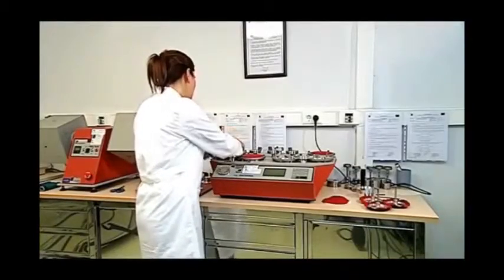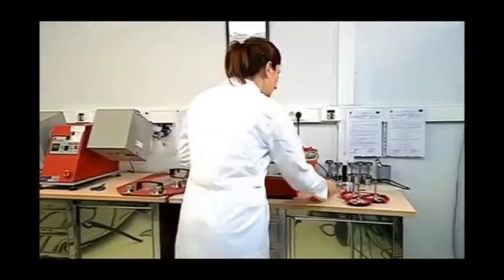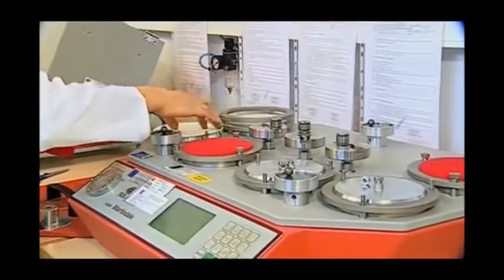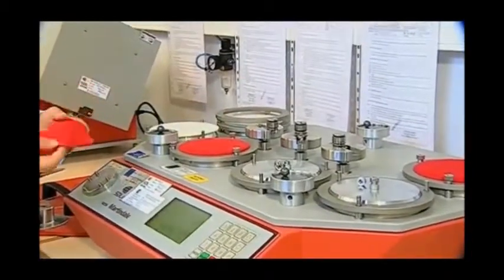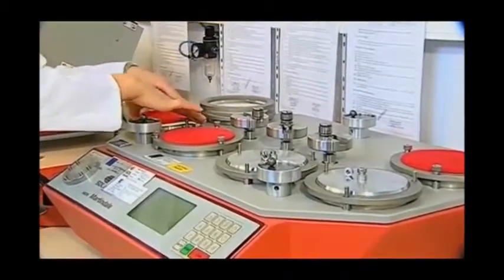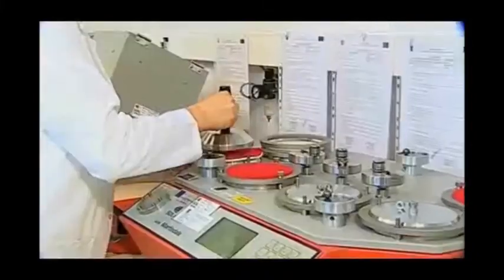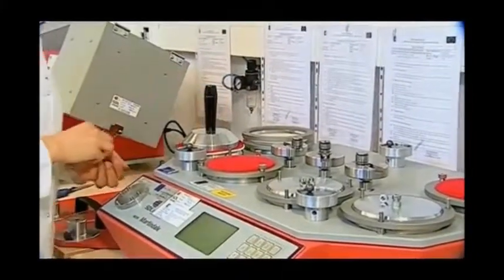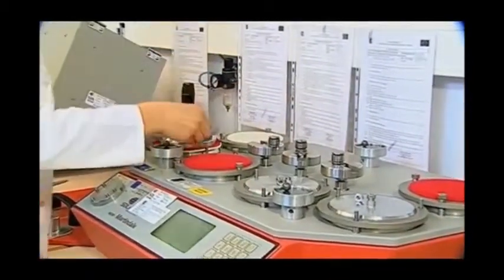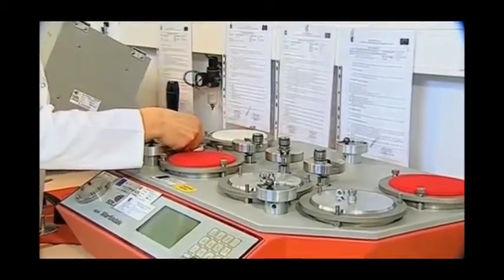First, the 140 mm diameter felt and the abrasive fabric are placed on each of the tables belonging to each sample on the abrading surface, in a way that the front side of the sample stays on top. As we said before, knitted and woven fabrics are abrasives themselves, whereas 100% woolen abrasive fabric is used for upholstery fabrics.